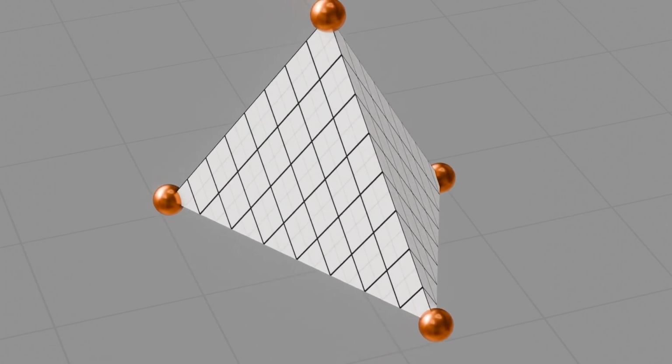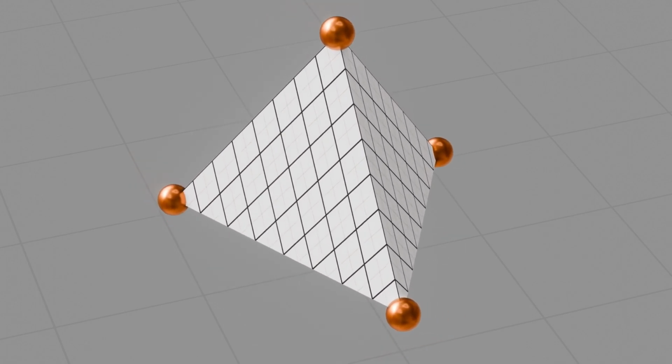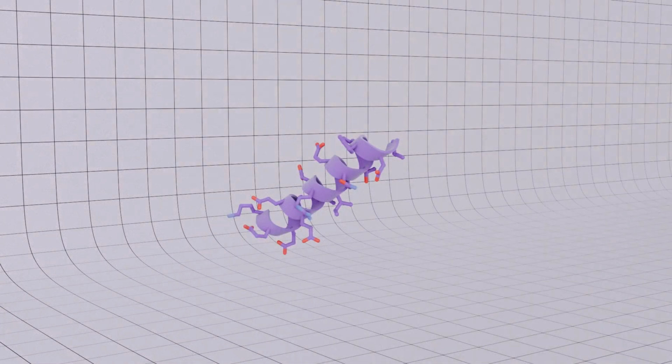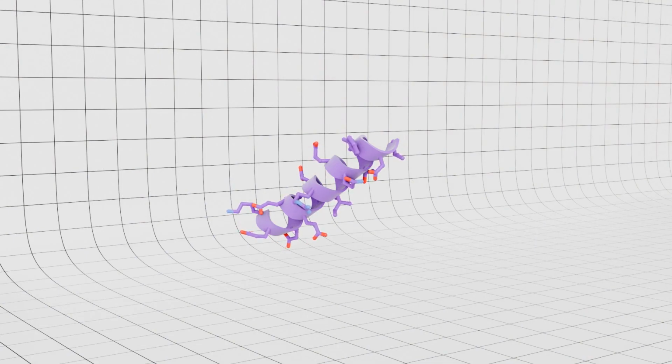And in addition to reducing the degrees of freedom, and so giving us more signal per thing we're trying to move around, it has an added benefit of imposing smoothness on these deformations. And when I say imposing smoothness, I mean the types of movement that are allowed, right? We're only allowing these continuous deformations. But it also means that within a tetrahedron, we can't have things moving apart. The tetrahedron must stay a single connected entity. And this is really good because we know that if we look at, say, an alpha helix, we don't want that alpha helix to just explode, right?